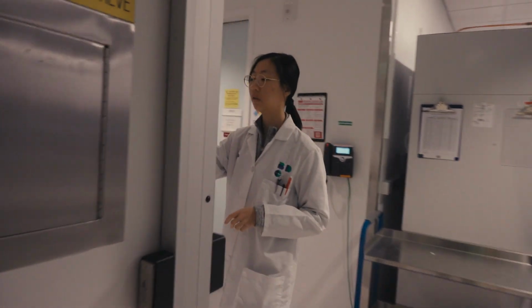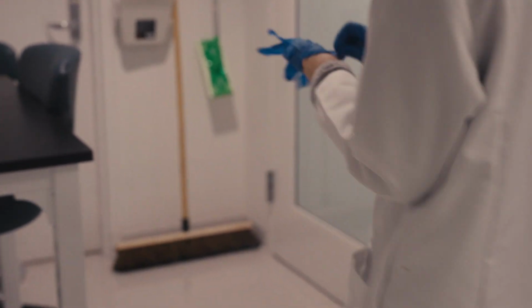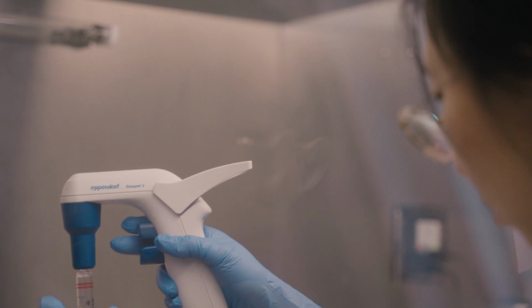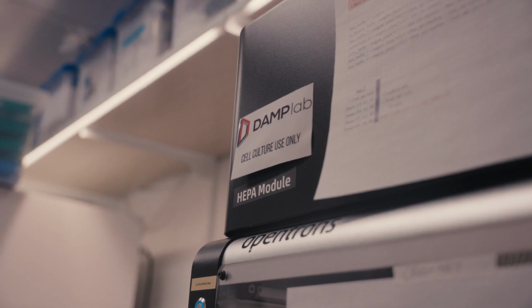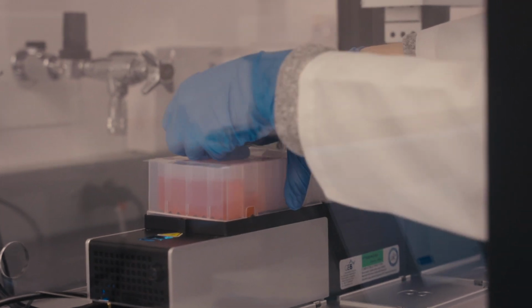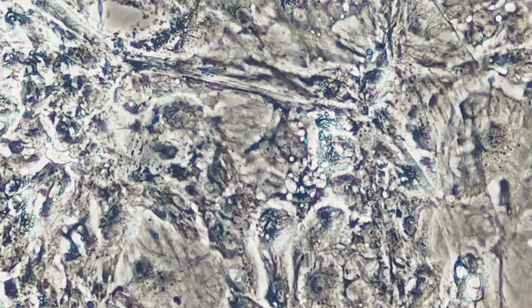People come to us, they tell us what they want. In the end, they don't really have any automation experience. The cardiomyocyte project, the research goal of that center is to use the amount of heart muscle tissue we produced to build a fully functional heart. They have 3D printed smaller artifacts, so the muscle tissue will grow around it and it will contract, like a heart pumping.